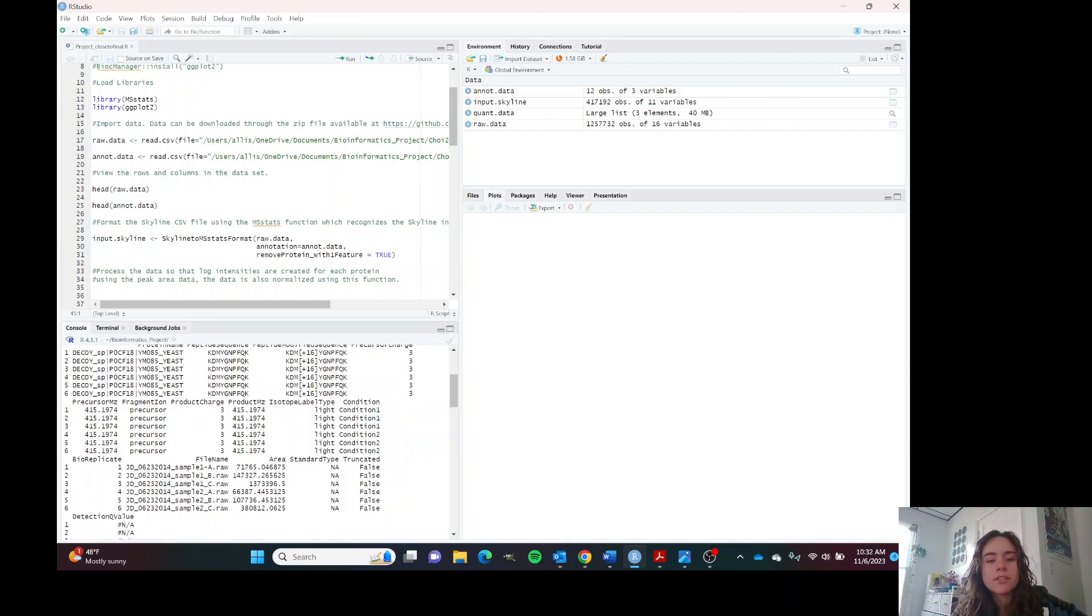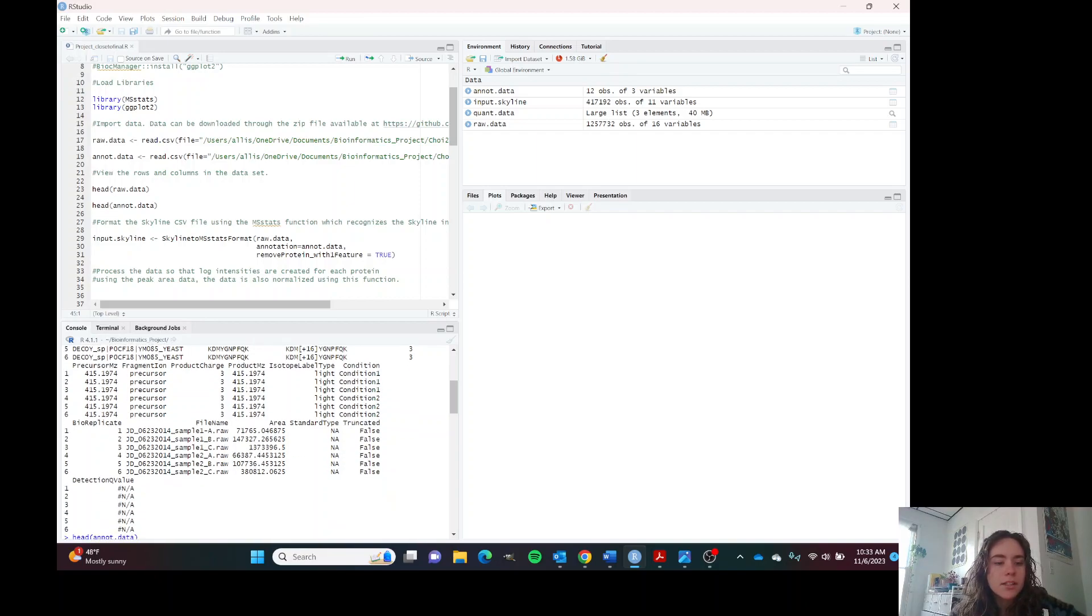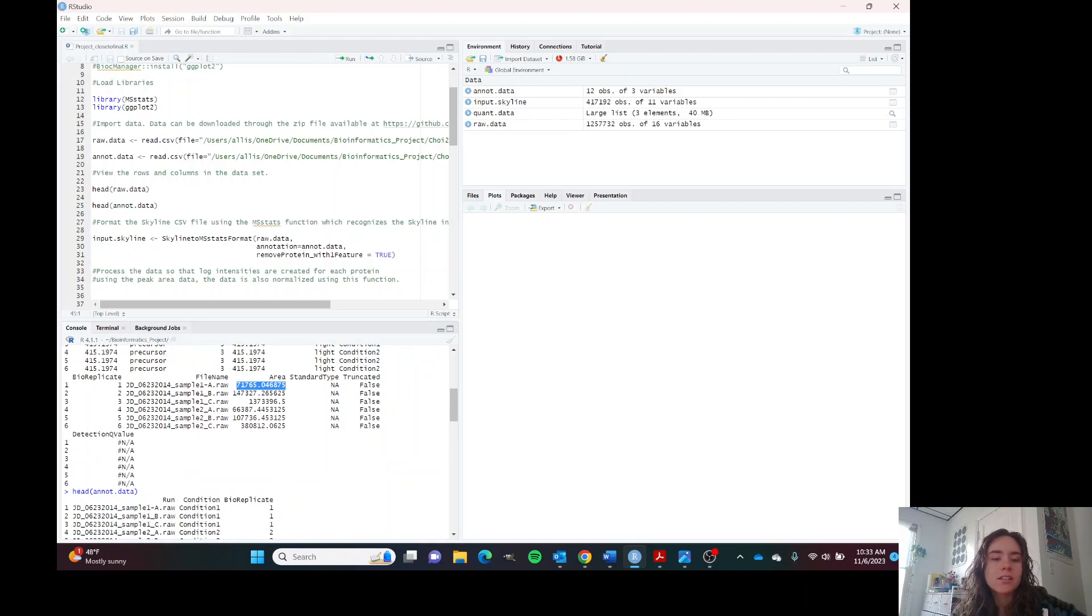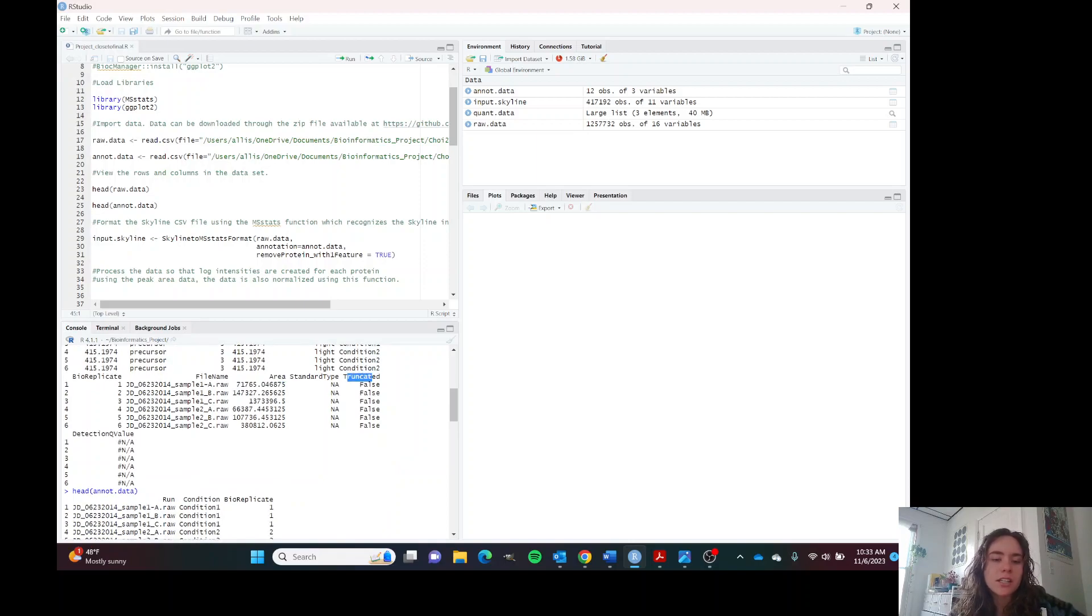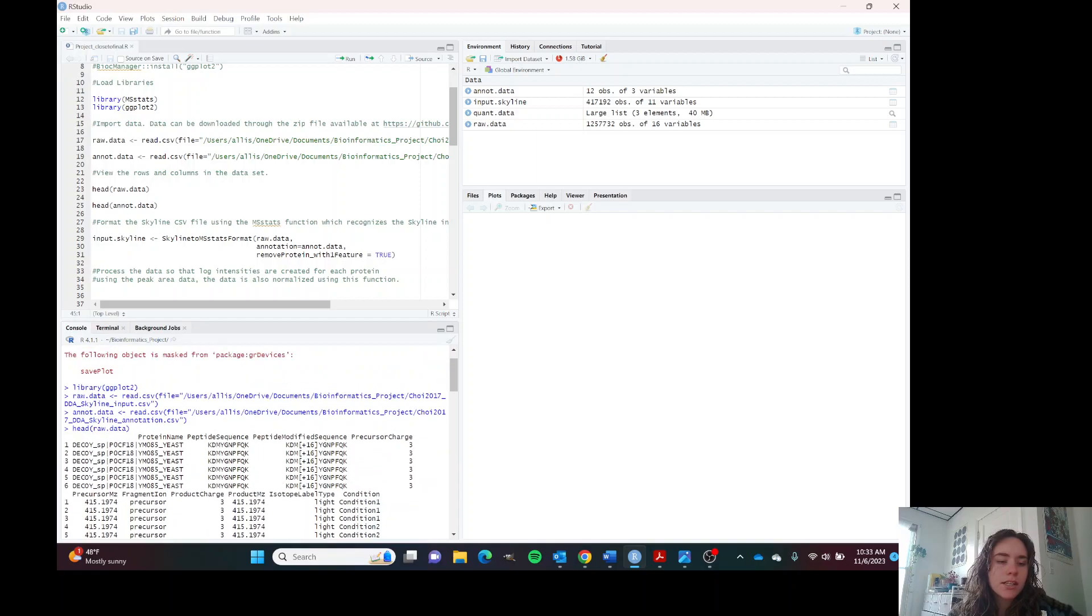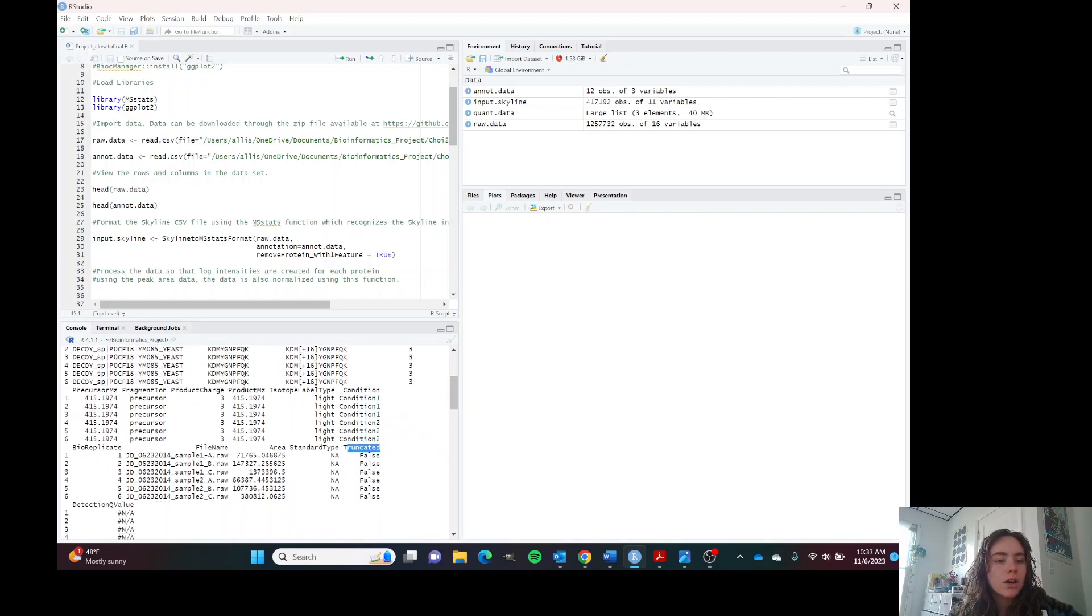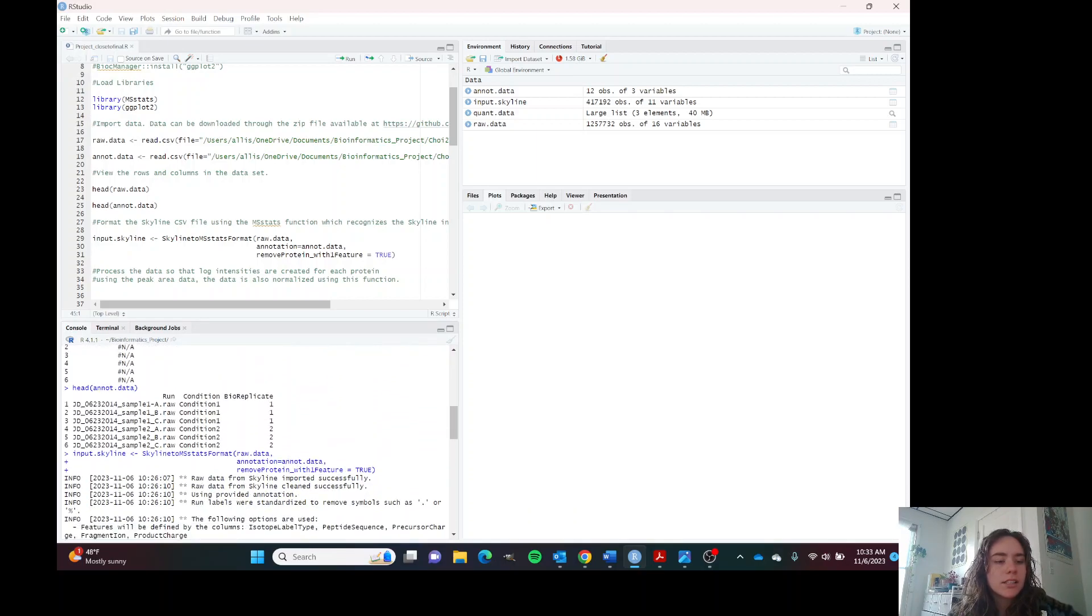This is an experiment that has four different conditions. And then we have a file name. This peak area or area column is the peak area and is how we measure the protein intensity. This truncated column I'm going to talk about in a little bit. This is kind of what our raw data looks like.